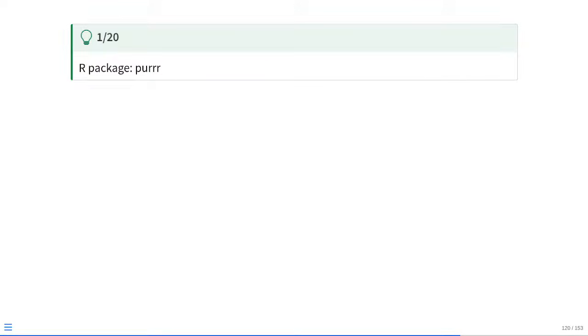So basically, I have this set up like a challenge style of seeing how much you remember from the earlier portion of the class as far as how do I go about troubleshooting? Is this package from CRAN? Is this package from Bioconductor? Is this package from GitHub? And then what installation commands would I use? Do I use the quotation marks? Similar things of that nature. So what I want you to do on your own time is work through these challenges.